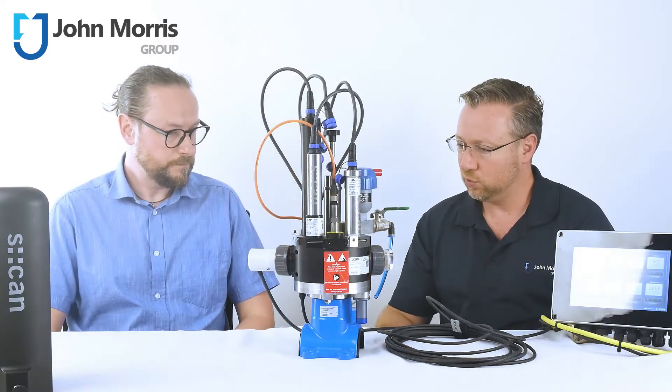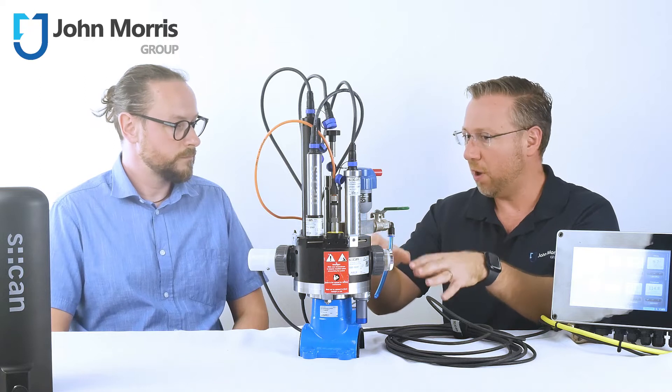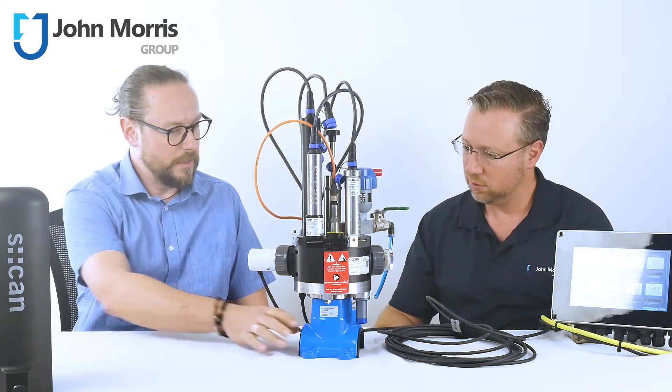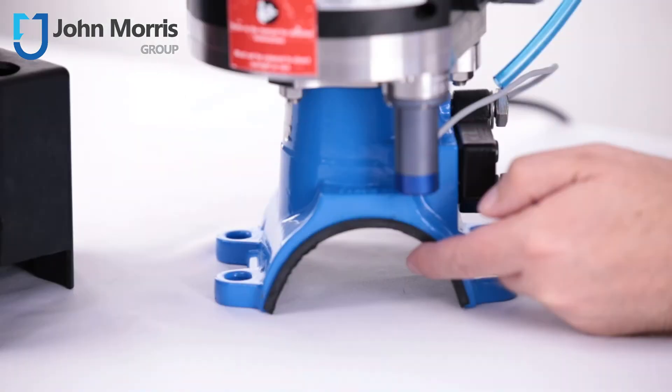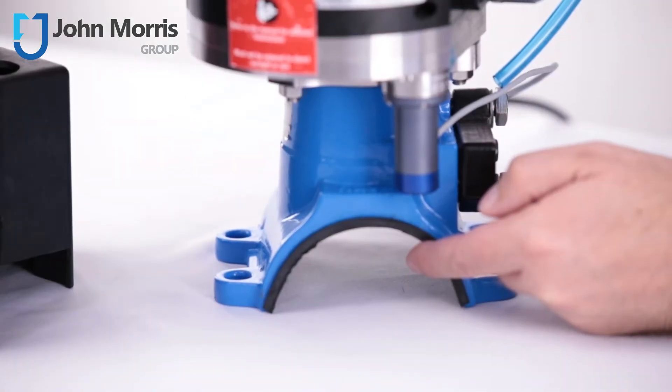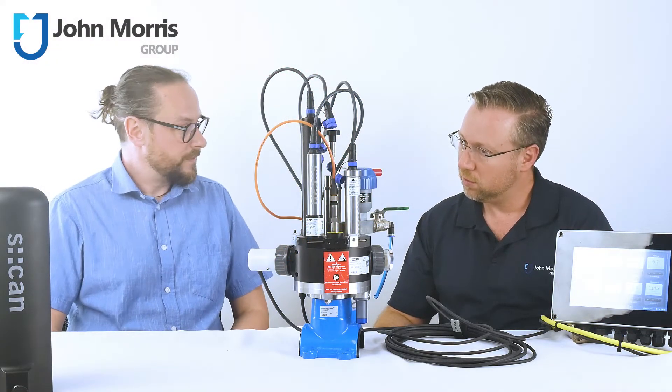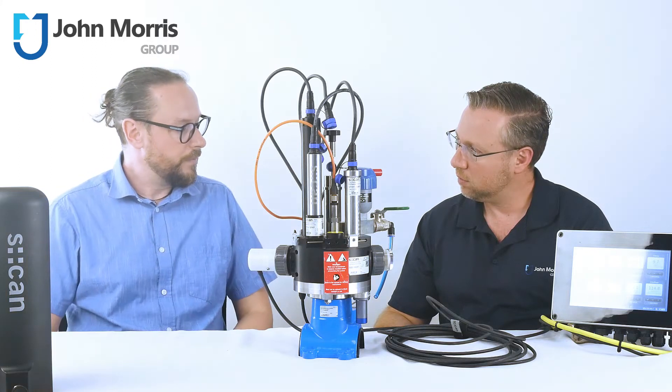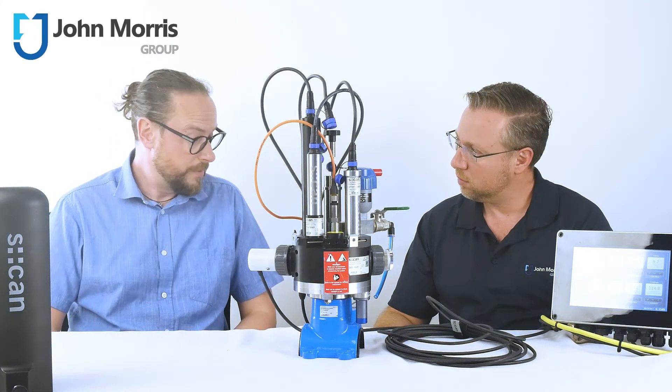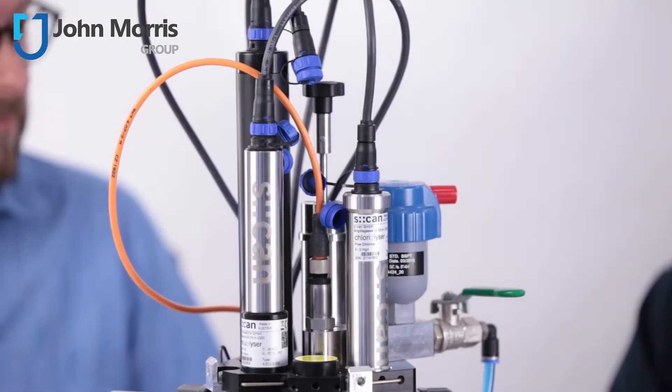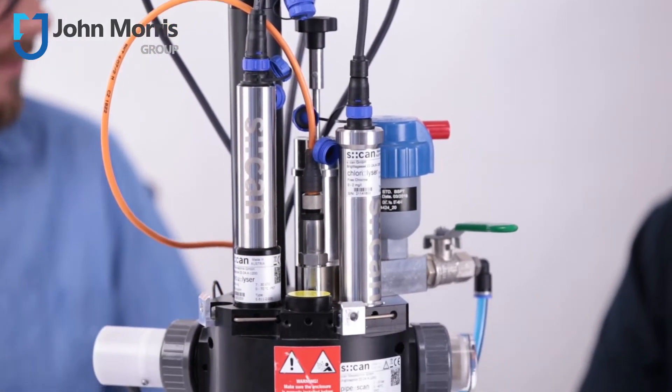Okay, and so how does this fit on a pipe? How do you put this on a pipe? You can see there's a clamp saddle at the bottom, and depending on the pipe size and the type of pipe the operator has, we can offer different clamp saddles and you fix it directly on the pipe. Depending on the PVC pipe or stainless steel pipe, we offer different clamp saddles for this.